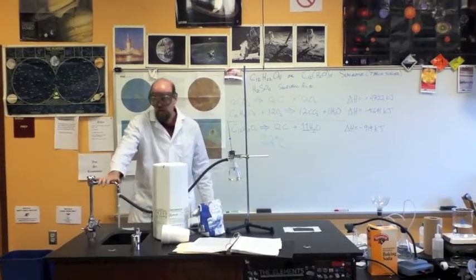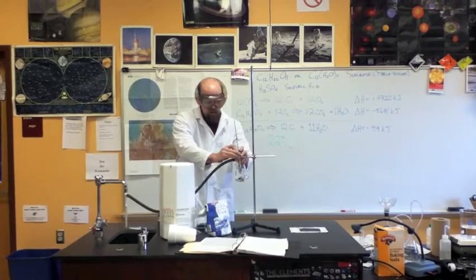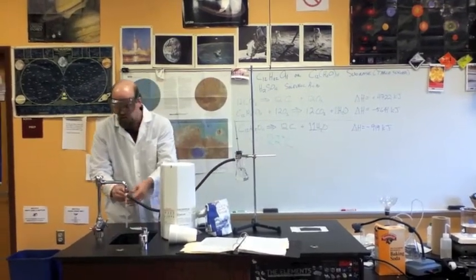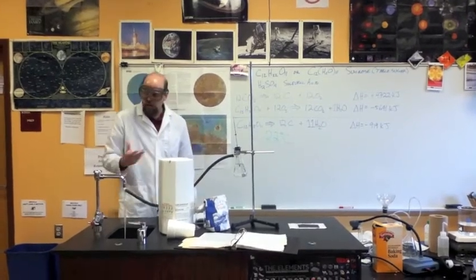And what I'm going to do is I'm going to turn on the aspirator and the aspirator is connected via this hose here to a tightly closed flask and that will allow me to reduce the pressure as you saw when we did that lab in which we did the vacuum filtration.